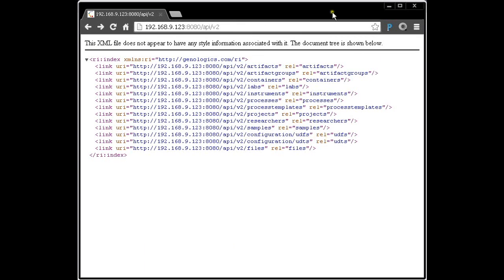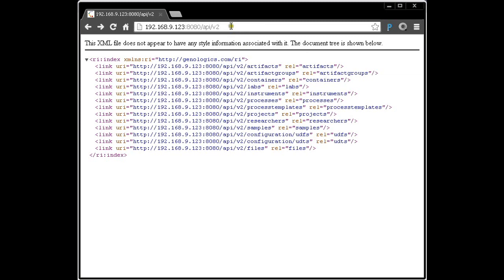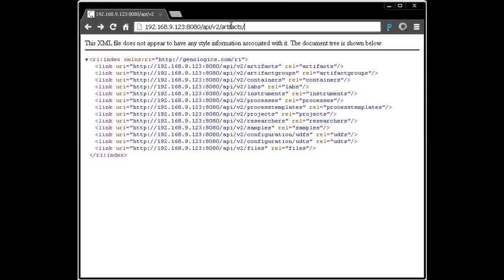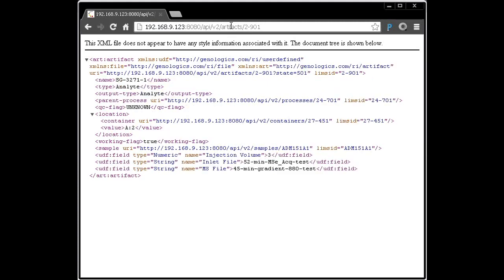If we look at the list here, we don't see analytes. That's because analytes are really just a form of artifact. So we'll find those under the artifacts. Then I will paste in the URI, or sorry, the LIMS ID into the URI.